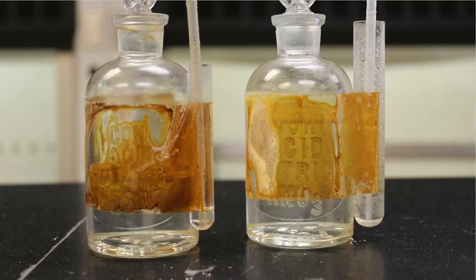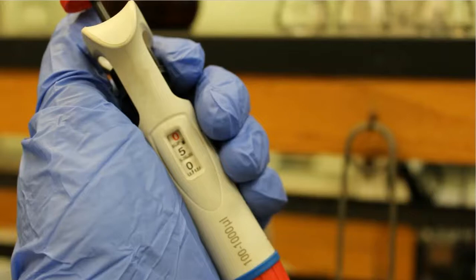All right, so those lab directions told me to put a ½ ml, 0.5, and then 0.6 mils of the other acid into a test tube and to cool it. So the way that I'm going to do this, I'm going to use a micro pipetter. I'm not going to use a glass pipette. I'm not going to use graduated cylinders. They don't really give me the total volume as properly as a volumetric pipette does. But this micro pipetter puts a little bit of automation to it.